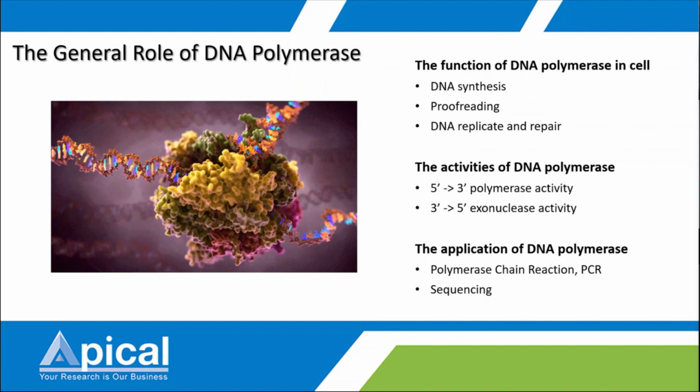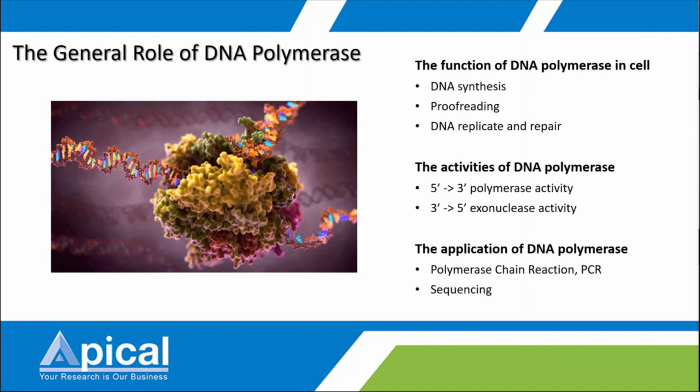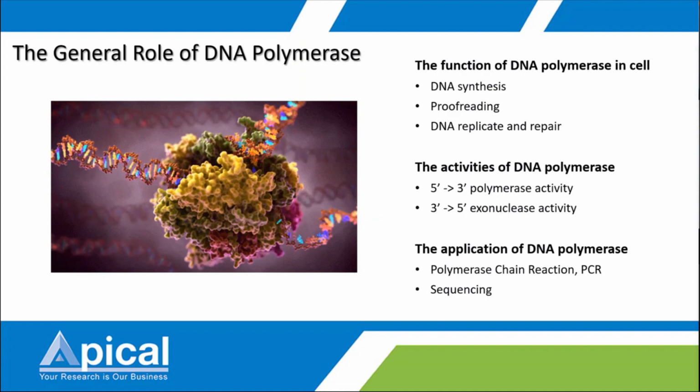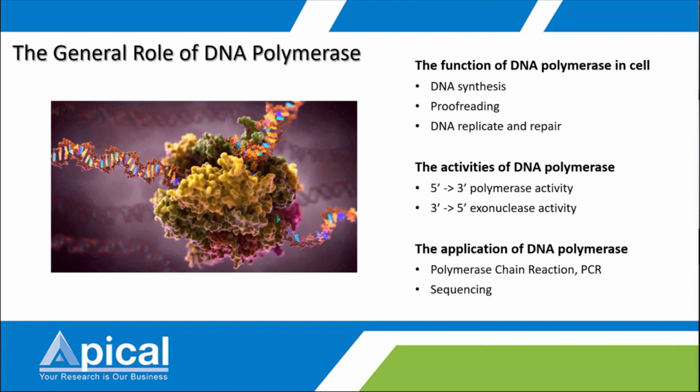DNA polymerase has two types of activity. The 5' to 3' polymerase activity allows it to read the original DNA strand and add nucleotides from 5' to 3' and form a complementary strand.